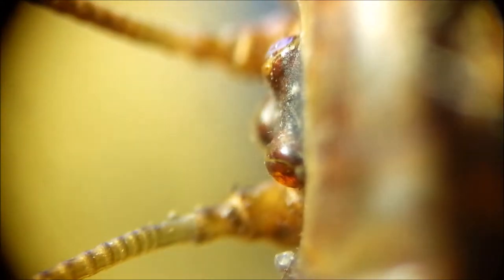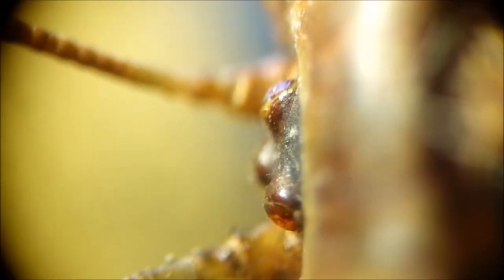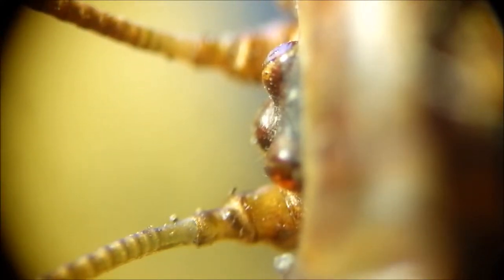Let's go back to the lower magnification. Oh yeah, okay, so those are three simple eyes that lay on the front of the praying mantis's head as well. So they actually have five eyes: two compound eyes and these three simple eyes right here in the front. It's pretty cool. Go down towards the body of the mantis.